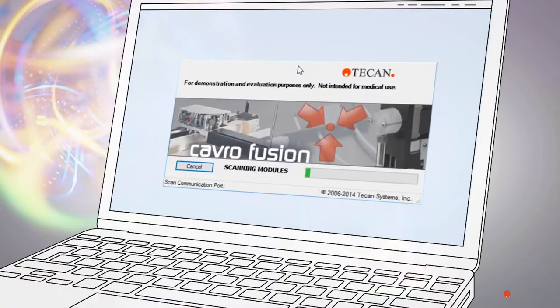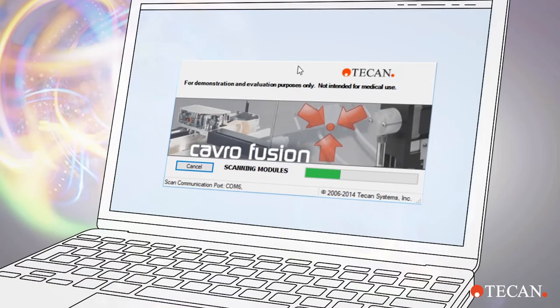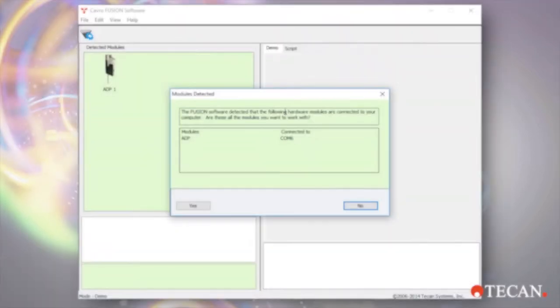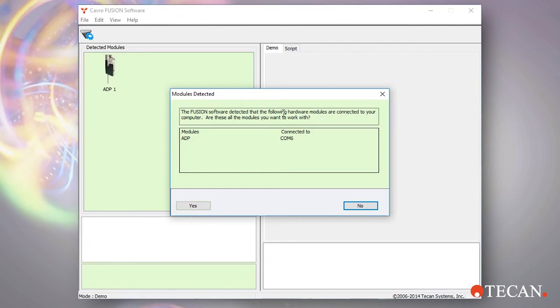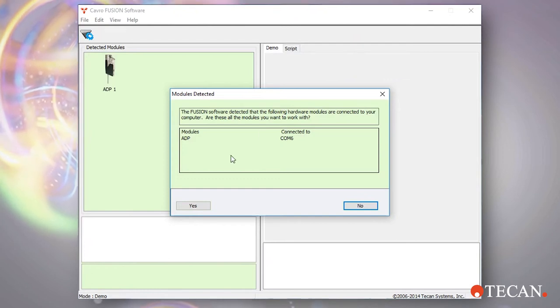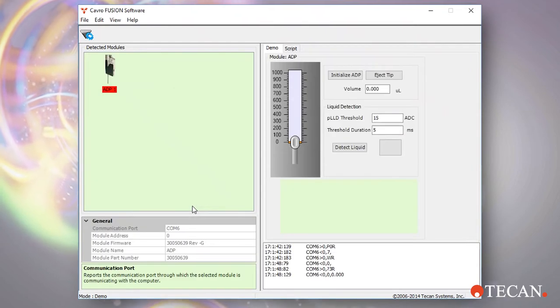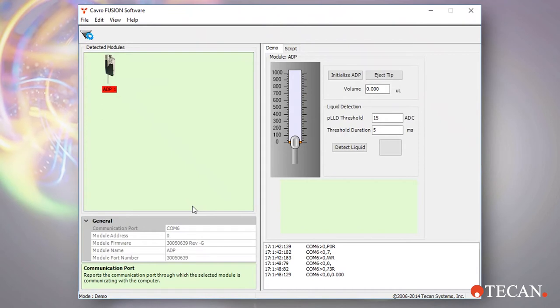Open the CAVRO Fusion software. It will immediately begin to scan the communication ports. After completion, the modules detected pop-up window will be displayed with the ADP shown as a detected device. Click yes to finish opening Fusion software. Note, this action may automatically trigger the ADP to initialize.